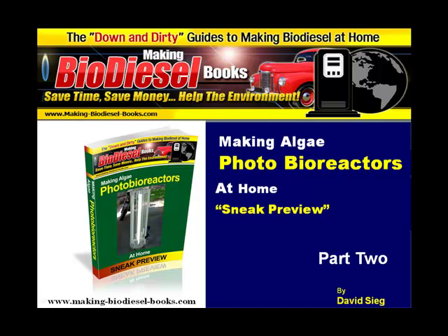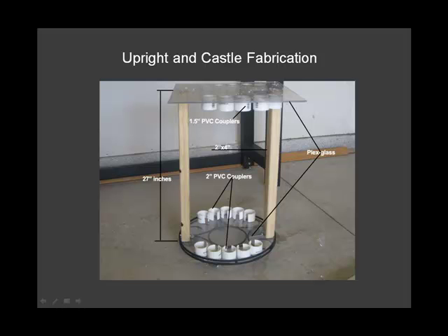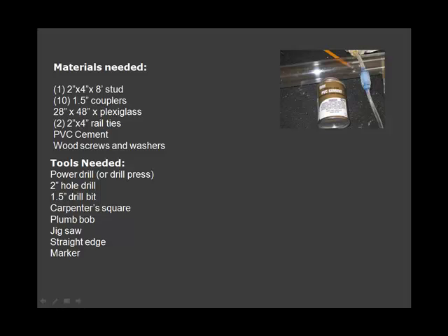Welcome to Part 2 of Making Algae Photobioreactors at Home. This is a sneak preview. First you'll see how to make the first part of the upright and castle fabrication. Next, here are the materials that are needed for the project.